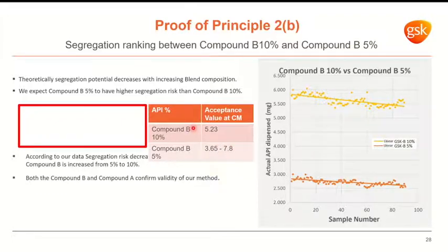So when we did our study and subjected it to RSD, before going to that, look at the graphs. For the yellow one, you can see that the segregation is over here, and for the 5%, here is the segregation. The reason they are separated is because the yellow one is a 10% blend, so the targeted value should be 5, and this is where it is going.